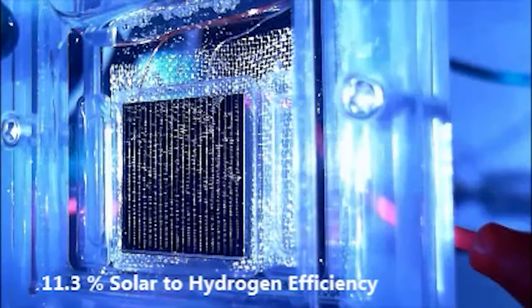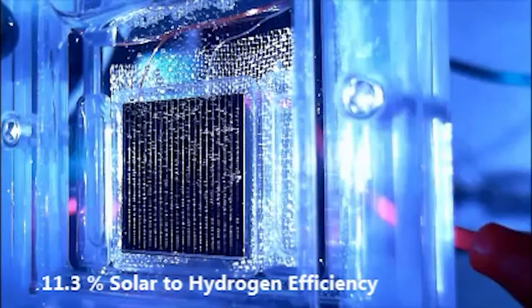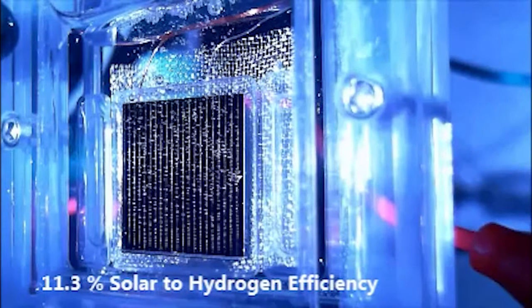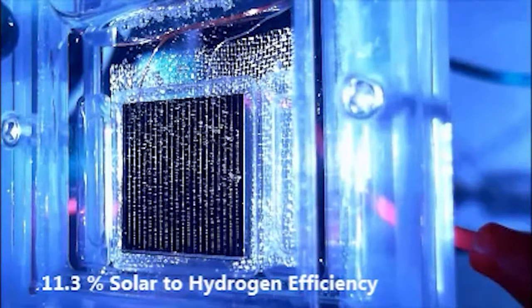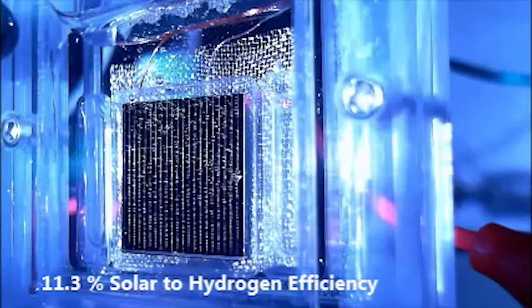Humanity is at the outset of the solar age, where sunlight will be used not only to provide renewable electricity, but also to drive chemical synthesis of fuels and materials to power and build for the next millennium.